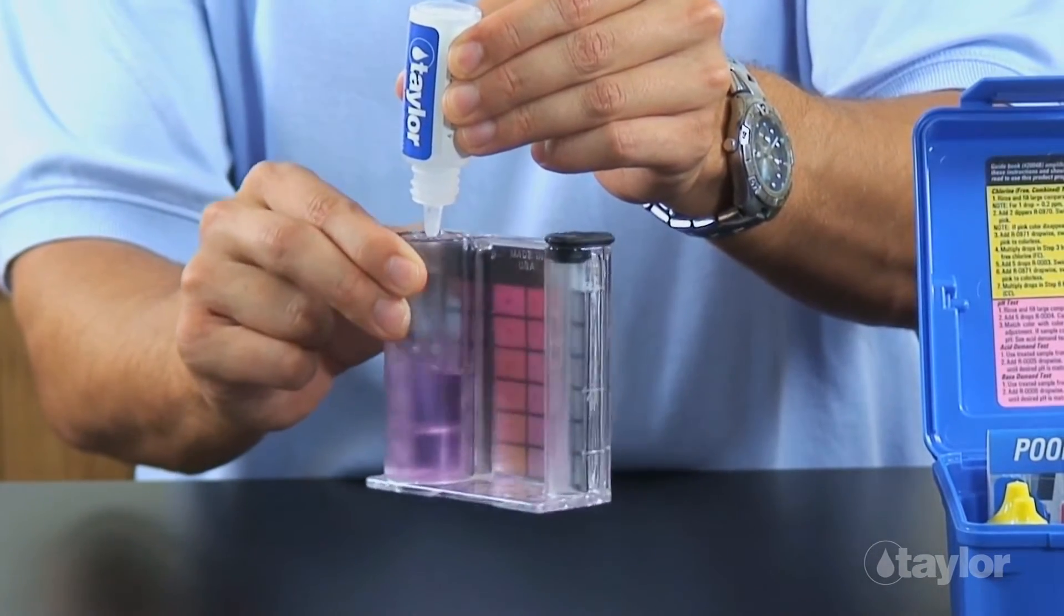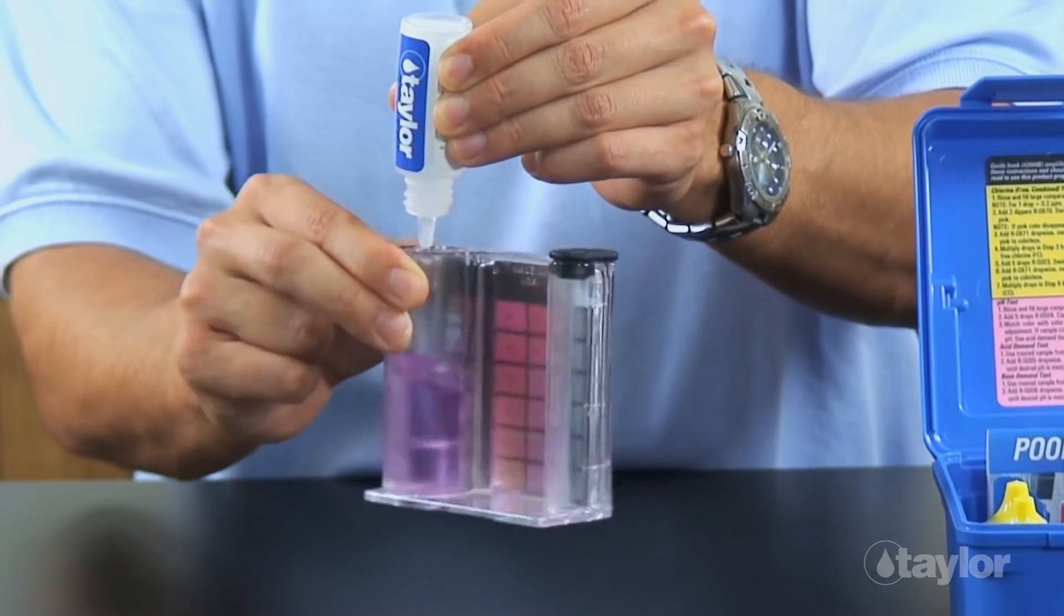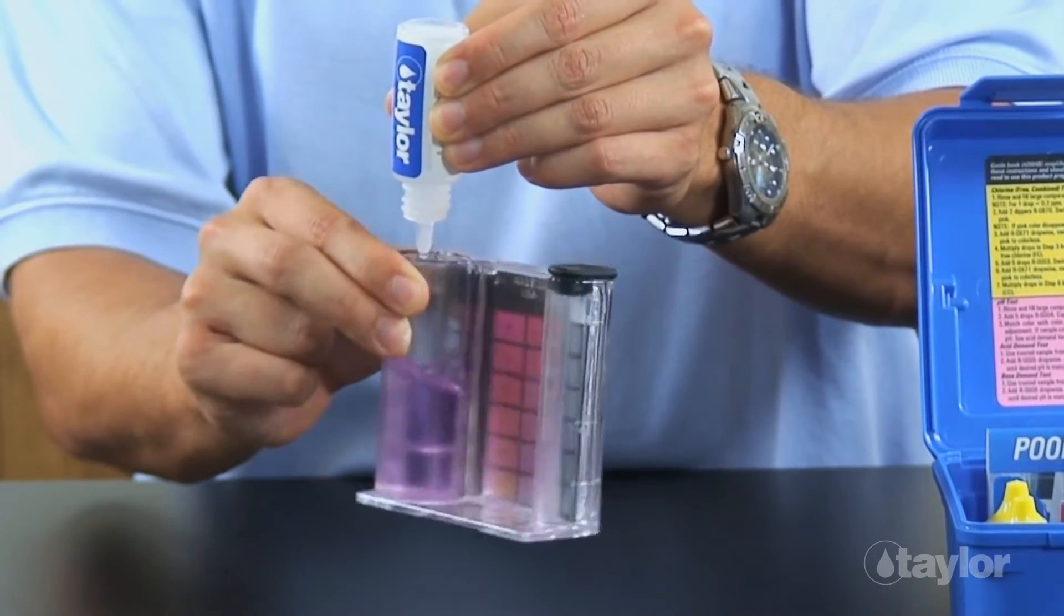Instead of obtaining a well-defined, permanent endpoint, some color change is observed, but soon the sample reverts to the original color.